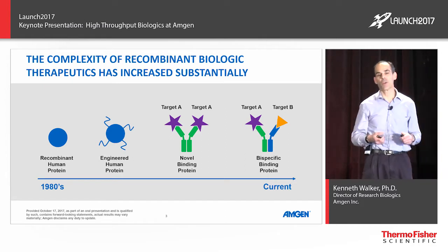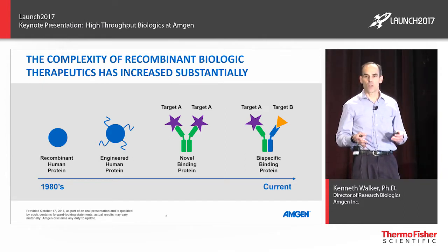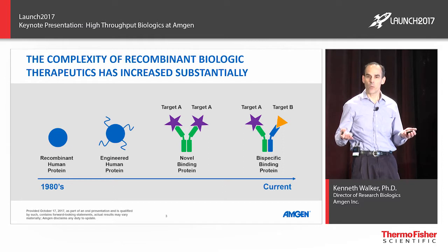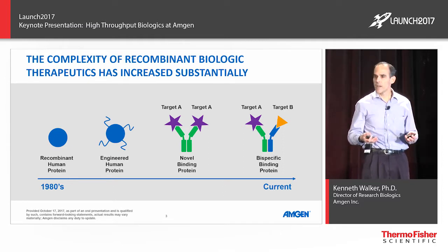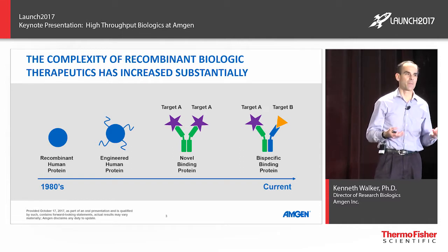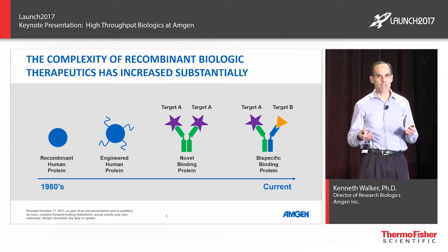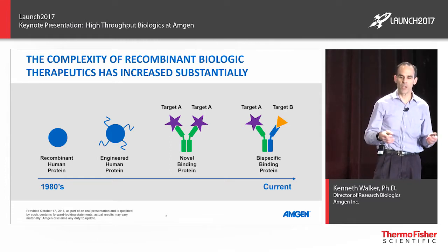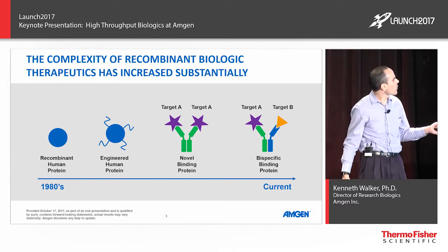And this requires a whole new setup to where you're actually doing high throughput screening, looking through tens of thousands to millions of different protein molecules to find the right one that binds and blocks your target. So at this point here, the informatics needs has actually gone up substantially. However, it's still something that can be managed with spot applications. You can do it. But the next wave was when things became even more complicated.